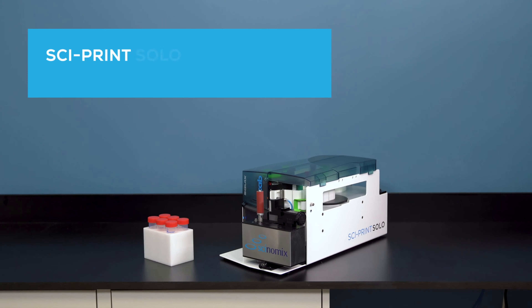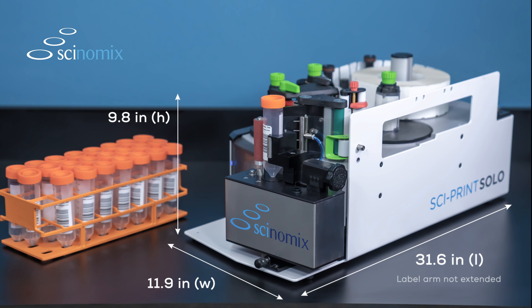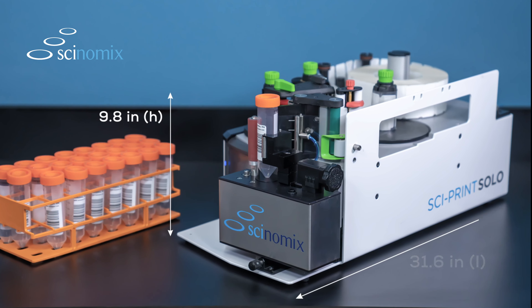Enjoy the quality and convenience of tube labeling in your lab with the Cyprint Solo semi-automated tube labeler from Synomics. With its small benchtop footprint, the Cyprint Solo can be used for standalone labeling or integrated into larger automated systems such as liquid handlers.